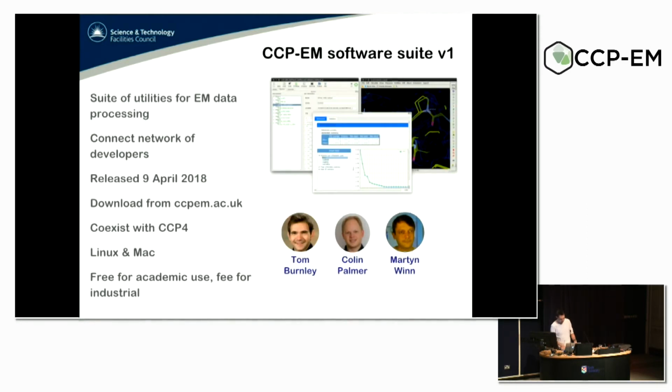So we thought perhaps the best way of doing this was to pool all of these new developments into one uniform package, the CCP-EM software suite. And as you may know, we've had a beta release of this going for a couple of years now, but we've finally released the version 1 of the CCP-EM software suite, and that's now available to download on our website.